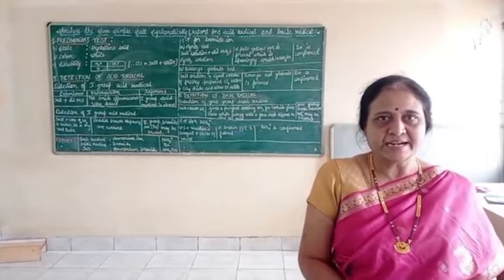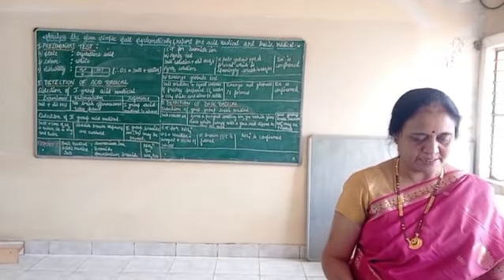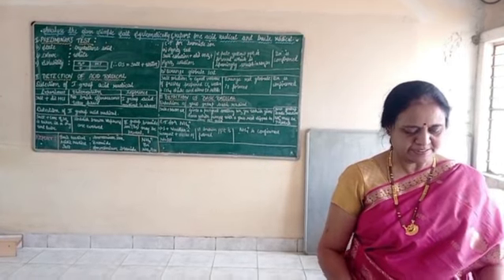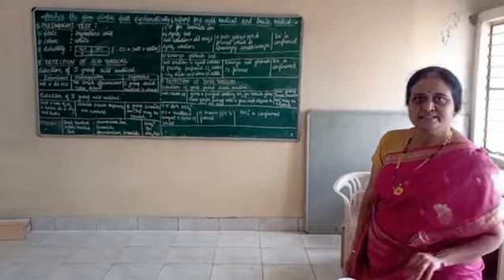A salt that contains one acid radical and one basic radical is called a simple salt. This is a simple salt. We are going to identify the acid radical and basic radical present in it. This analysis is done in 3 steps.